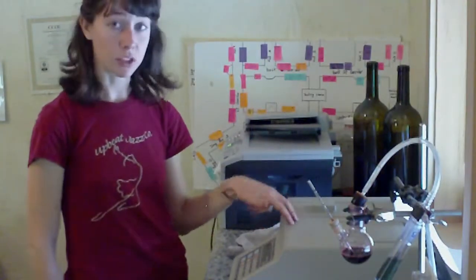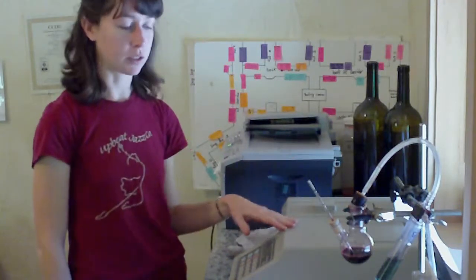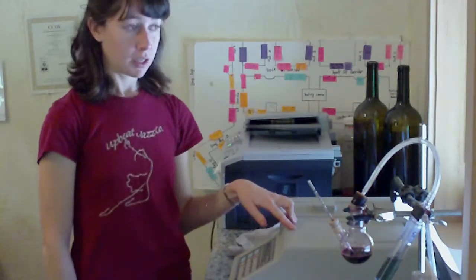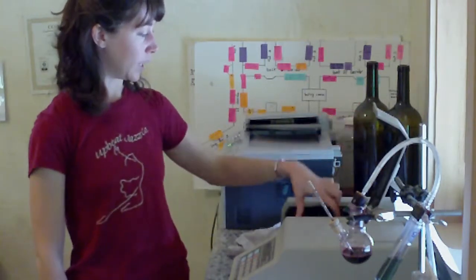This machine is a spectrophotometer, which we use to measure malic, the amount of malic in the wine, and then also residual sugar. And you just put little samples of wine, cuvettes, mixed with other enzymes. It measures enzymatic reactions. It's complicated, and I won't really go into all of it.